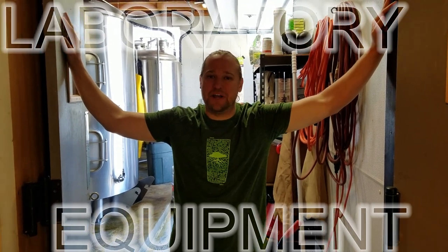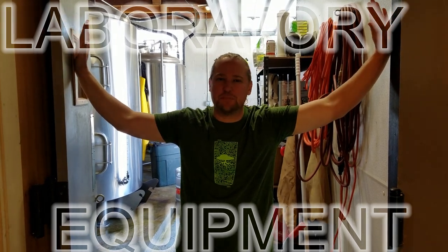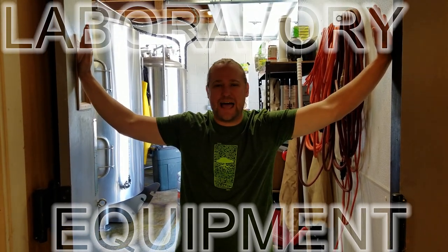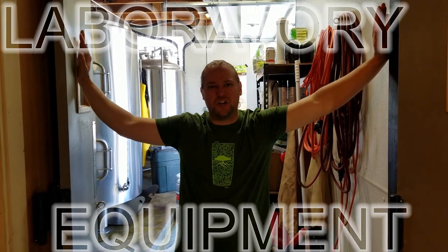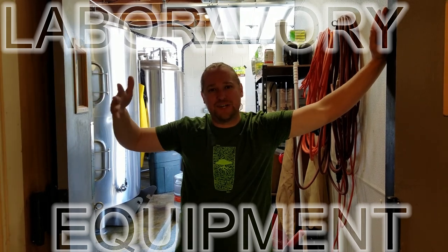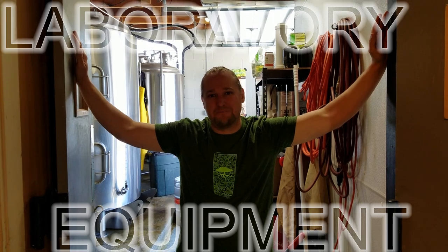Hey Brewery Life, Jasper here. I've had a lot of people interested in just setting up a small lab and the lab pieces I have going on back here. I have a small little area, a mobile lab that I'd be happy to show you guys today. So let's go check out the small lab setup. Cheers.